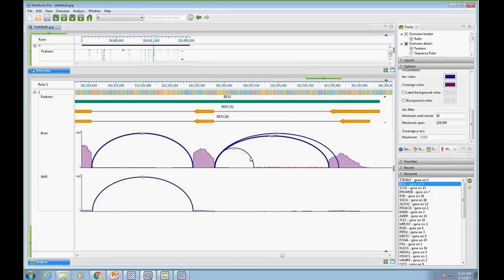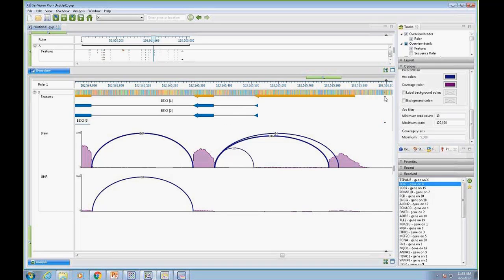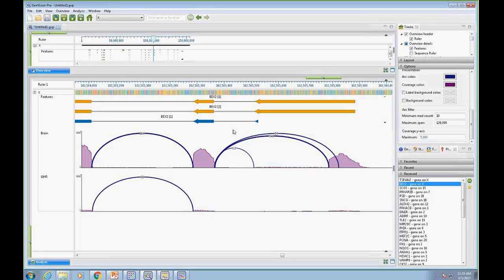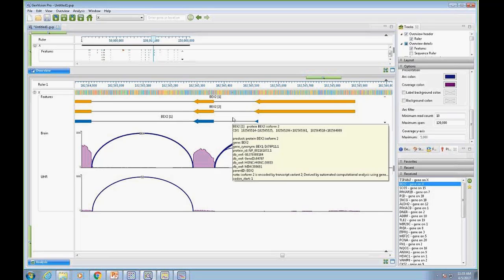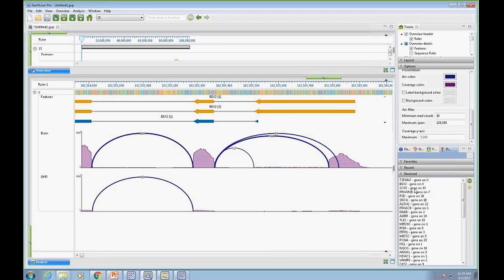of the splicing. Then we get these other little arcs like this 12. I don't know that that's real. I don't see any indication in the annotations. Oh, there's something as I scroll up. Here's these other isoforms then. If I hover over it, I can see an isoform 2 that starts right at that same spot. So I can visualize now at the 5' end of these transcripts that it looks like we have 3 different isoforms present. And it's very efficient now.